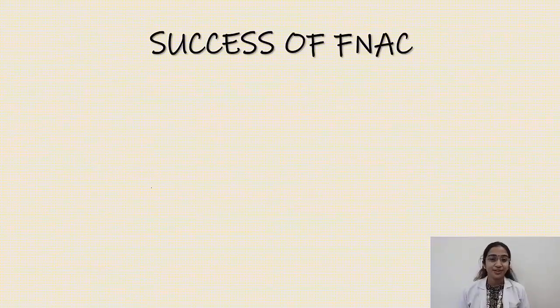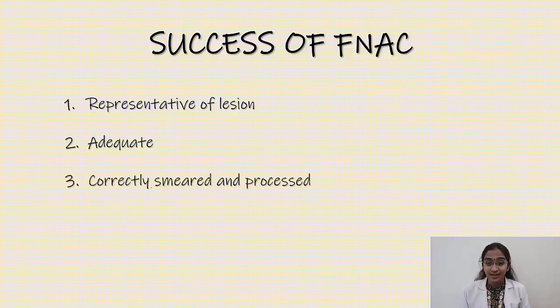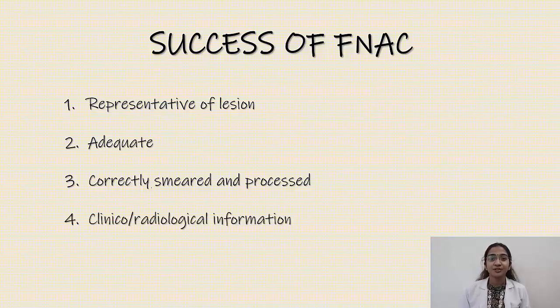The success of an FNAC depends on 4 fundamental requirements. Number 1, the sample must be representative of the lesion. Number 2, the samples must be adequate in terms of cells and the other tissue components. Number 3, the samples must be smeared correctly and processed. And number 4, it should be accompanied by the relevant clinical and radiological information.